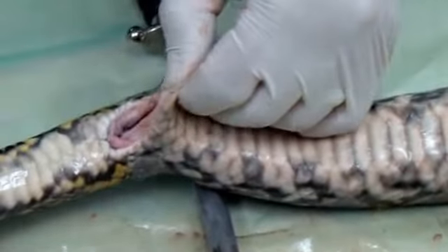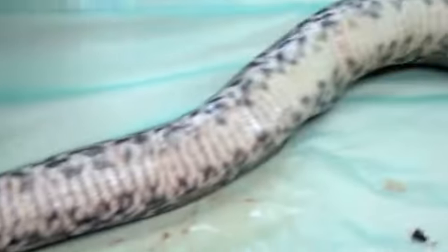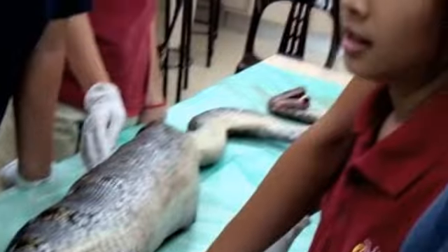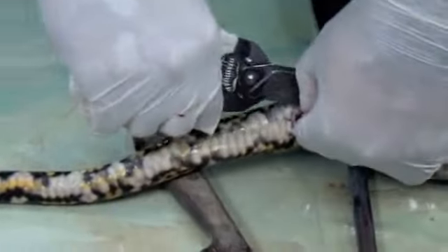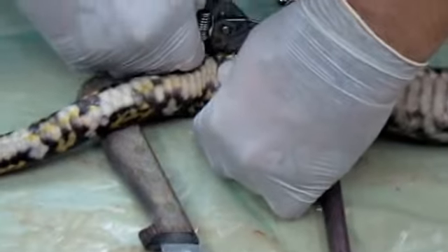I'd buy the skin. Do you have any of the snippers that you want to use? Do you really want to use the small one? I'll try both. Well, one of my friends, look at the blue thing right behind you. There should be smaller sets of scissors. Which one? Hand me a smaller set of scissors, please?